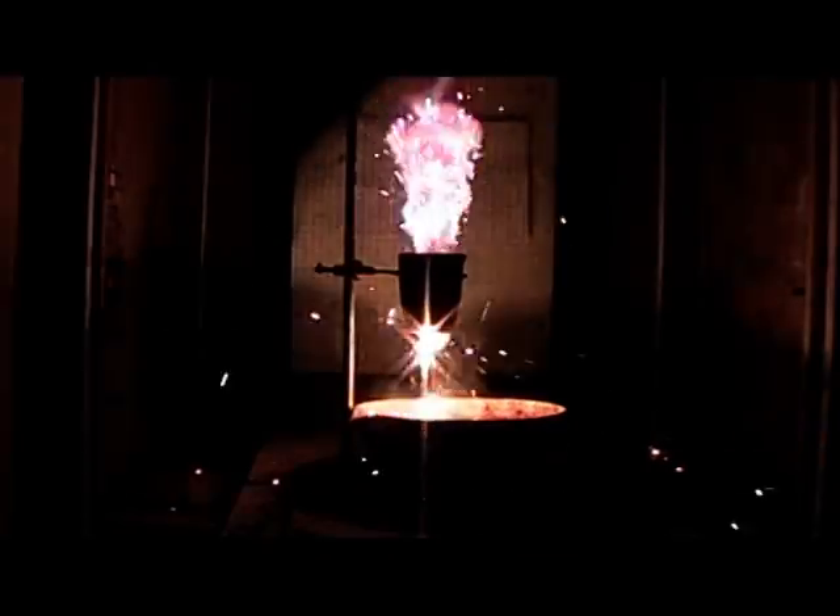Okay, without further ado, just add the permanganate. I hope that reaction will start quite quickly. Okay, I can see some smoke coming out, so I'll just turn the fume cupboard on and the light off so we can see the reaction properly. You can see the liquid iron pouring out of the bottom of the crucible.